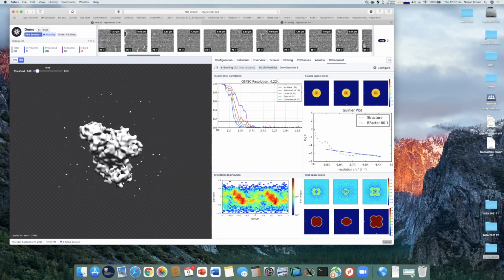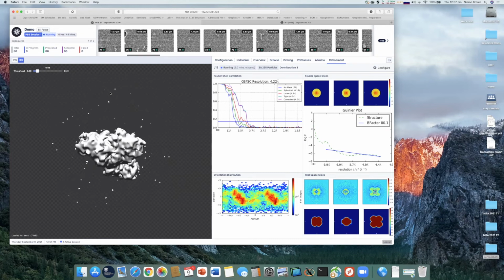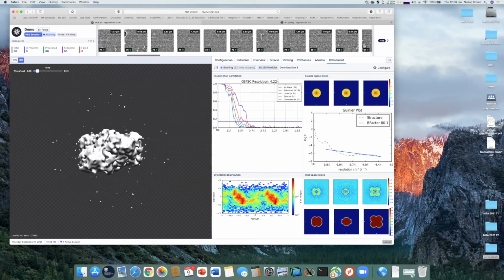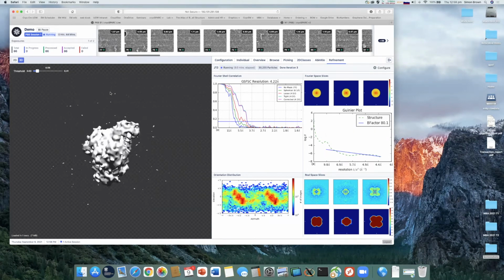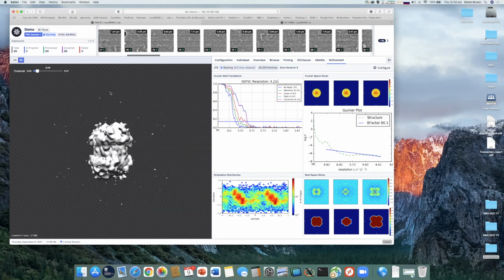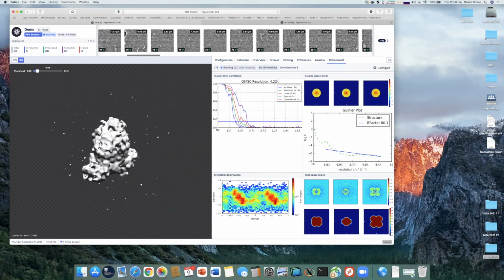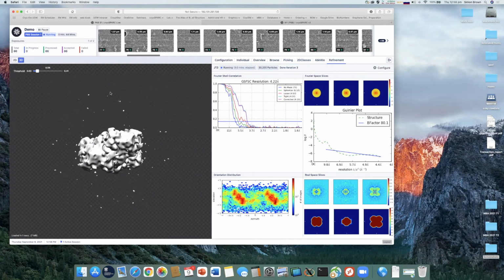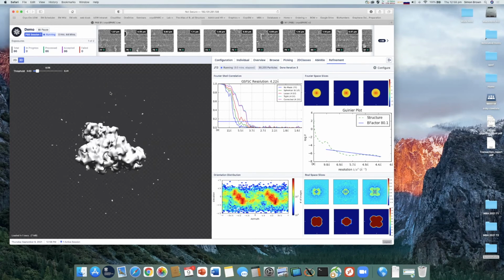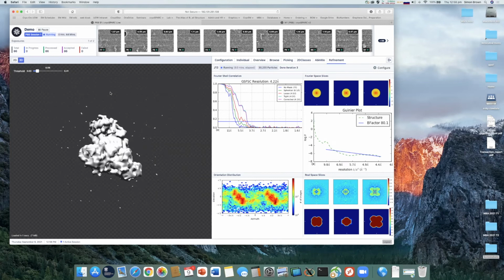I guess this is one of the things you've pointed out: if you're doing pure commercial work, there's a straightforward process to go out and get a commercial license. But if you're not actually a commercial entity in and of itself, then cryoSPARC, because I've also had these conversations with them as part of the licensing, are pretty relaxed.